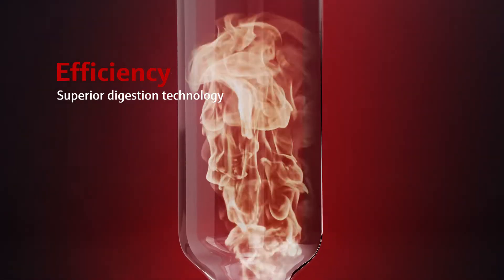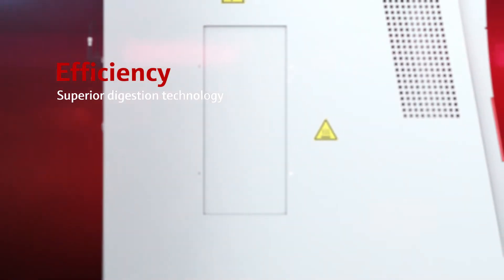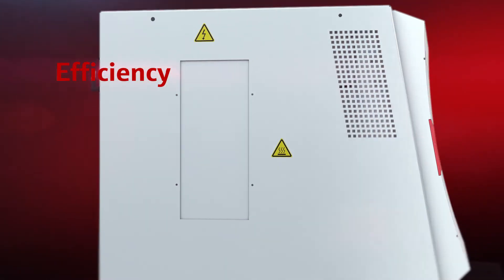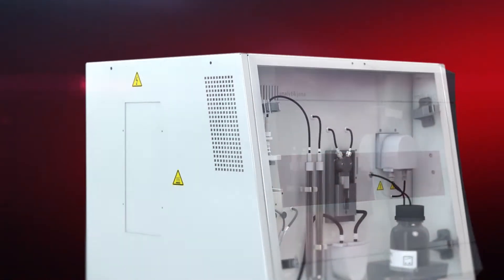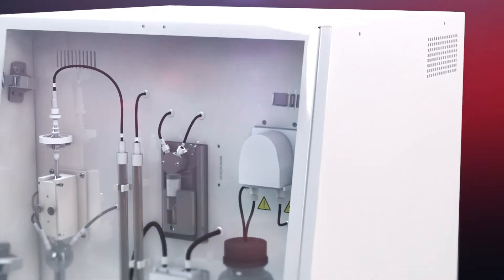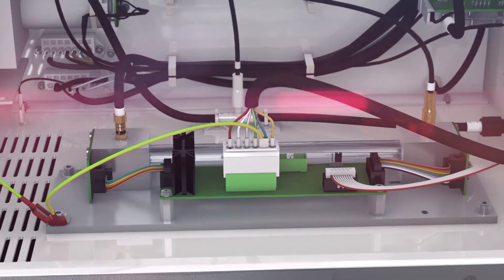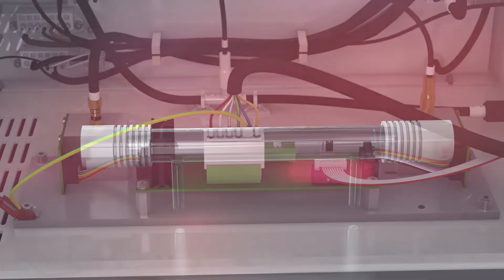The efficient digestion technology of Multi-NC permits extremely low catalyst consumptions and an exceptionally long lifetime of the combustion tube. This is particularly relevant for extreme matrices.